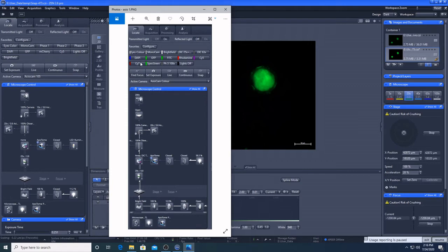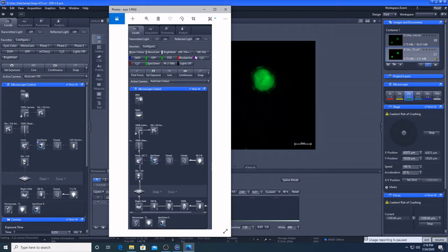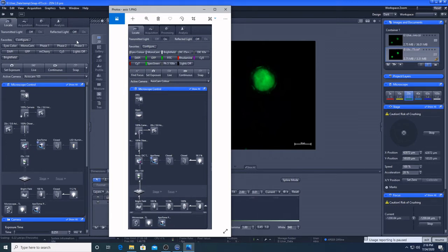So we've got the other fluorescence cubes, we've got very similar. So we've got the DAPI, the GFP, and then we've got the red side of things. The Axio 02 has got more options for phase imaging if you need to do that, whereas Axio 01 would be your choice for if you need to use DIC.